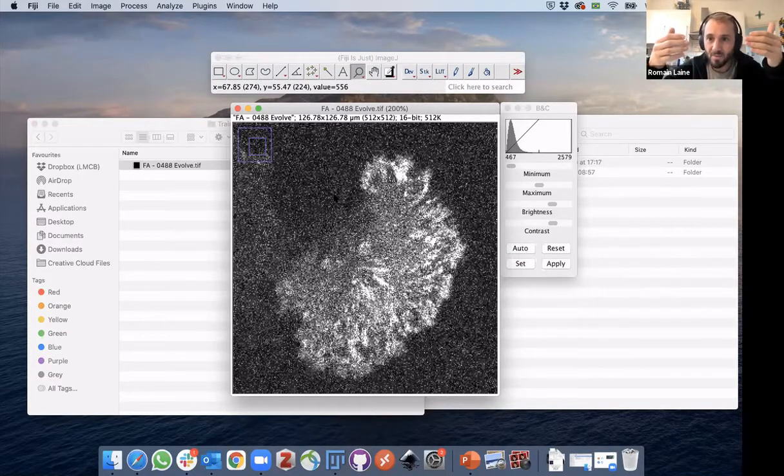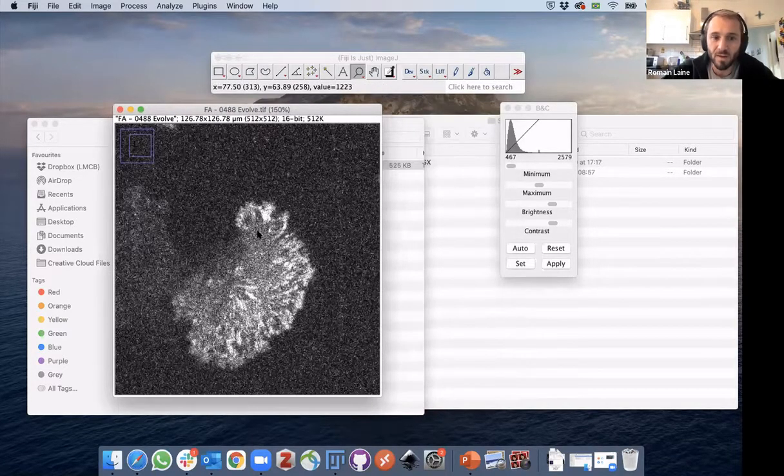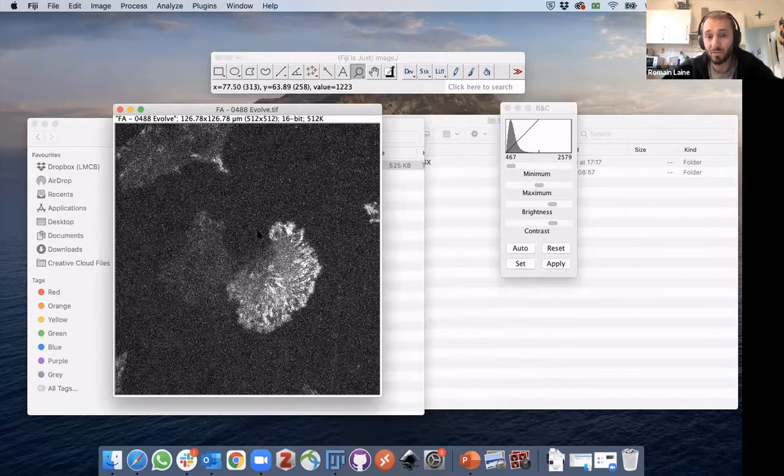And over time, the only redundancy that happens by predicting those pixels is the denoised underlying structure and not the noise. The noise is completely random, it's unpredictable in nature. And therefore, by forcing it to learn a predictable underlying structure, that's inherently producing an image that will be denoised. And I think it's an absolutely smart idea that makes things extremely powerful in this case, because it's very versatile due to the fact that you don't actually need to even provide the ground truth data set that accompanies the training data set.